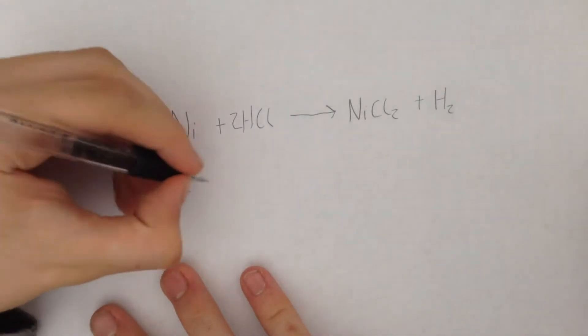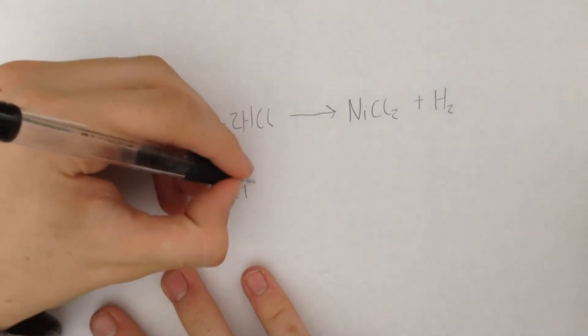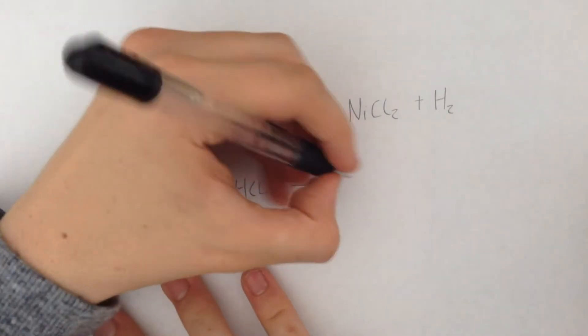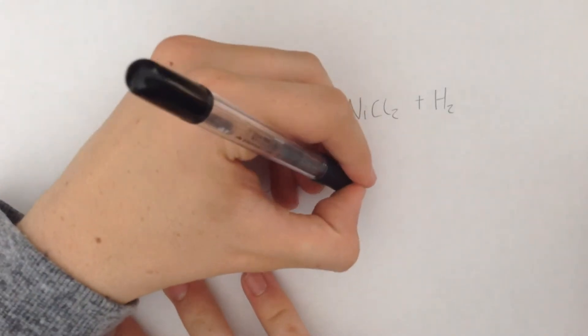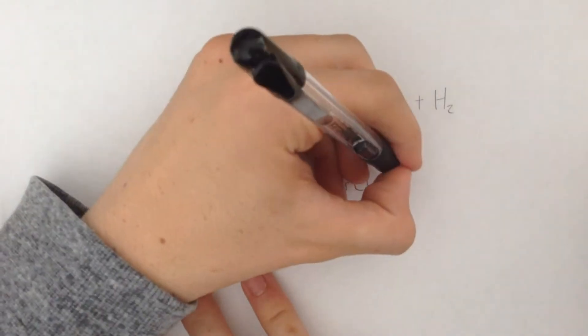The chromium does the same thing but reacts with the HCl to form chromium 3 chloride and once again hydrogen gas.